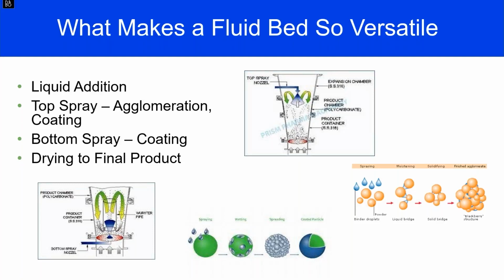So if your fluid bed isn't operating right, if your atomization is not operating right, all these things can have an effect, and pretty soon you cannot have the agglomeration process that you're looking for. But most of what we're going to be looking for is this grape cluster structure. Now, this is the background.